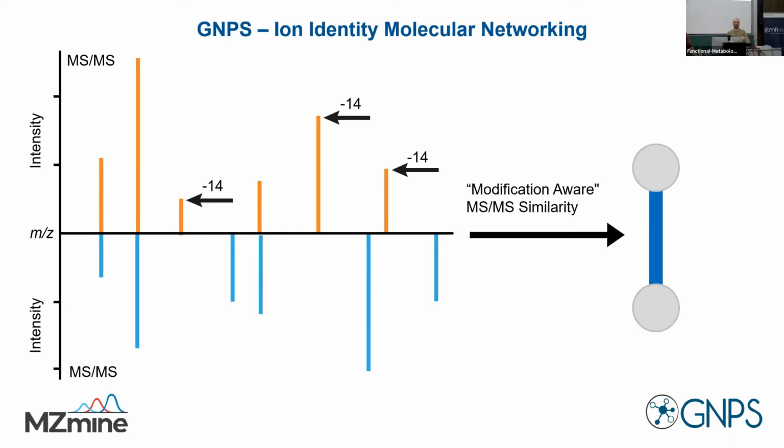I'll show you later how to get quickly back to the settings and change those for new jobs. There's a maximum connected component size, where you define the maximum number of edges that one node can have. And I think by default that is 10, right?